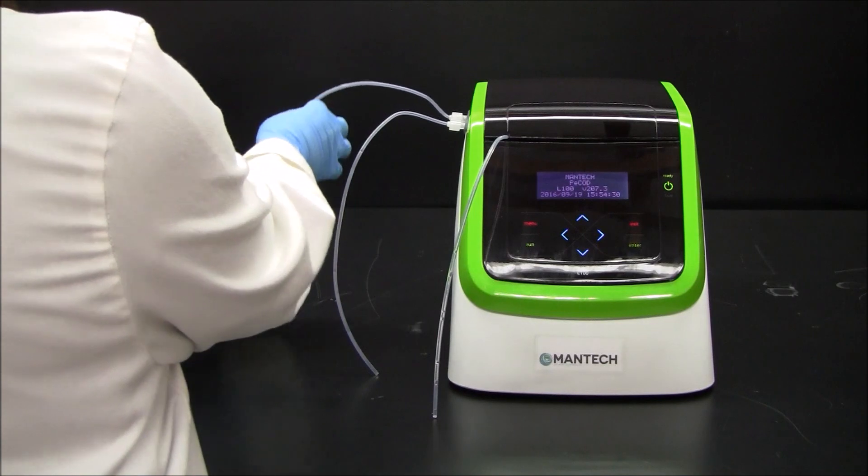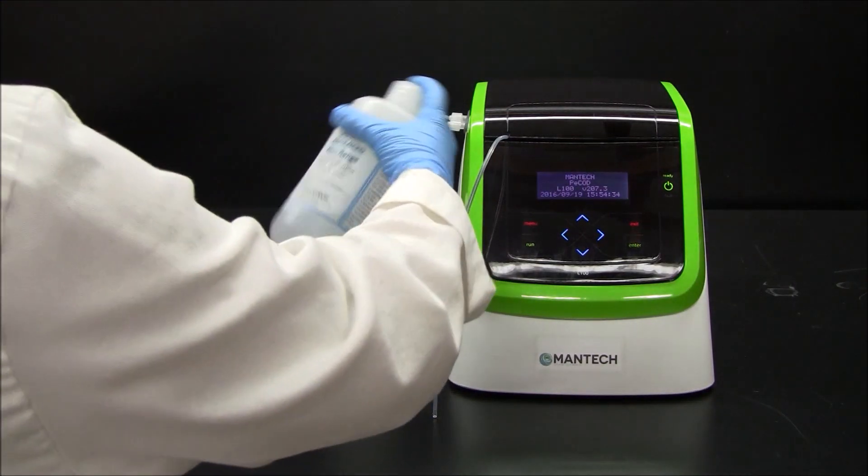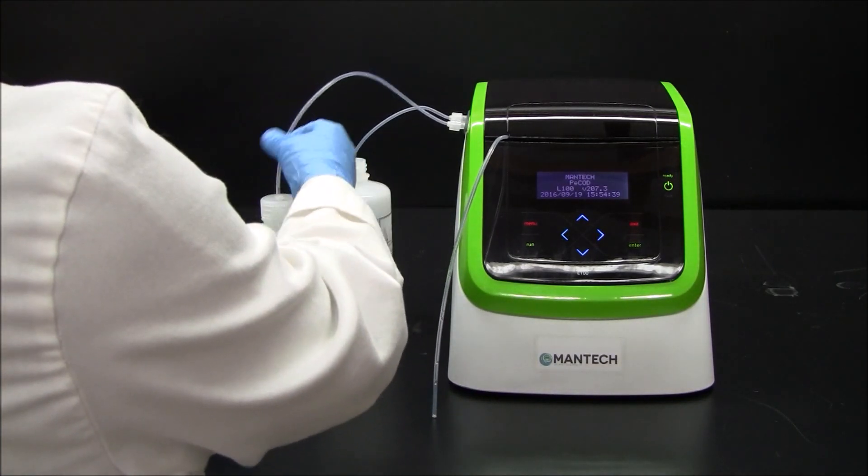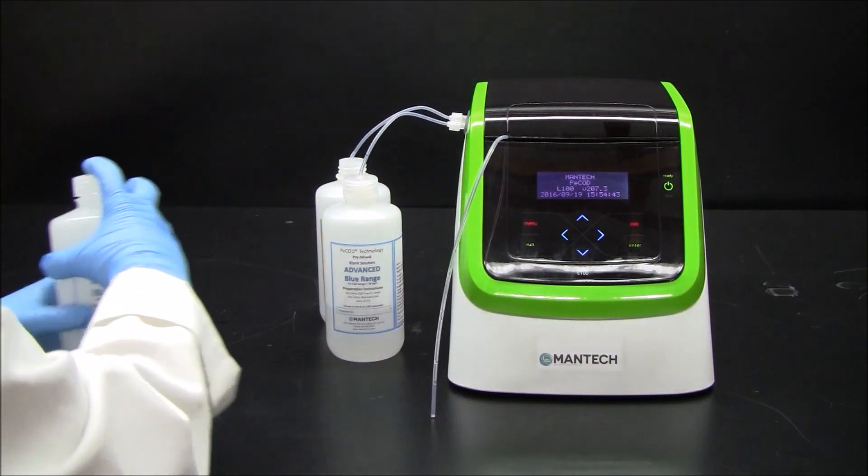Place the waste container at port W. Mix the blank and calibrant solutions as specified in the quick start guide. Invert several times to mix. Place the blank solution at port B and the calibrant solution at port A.